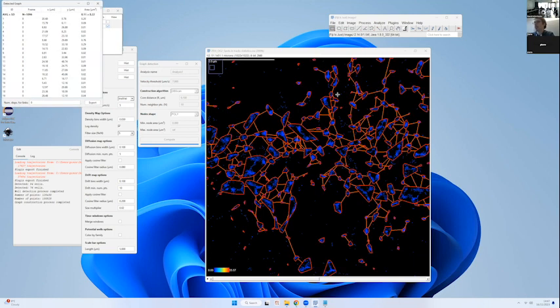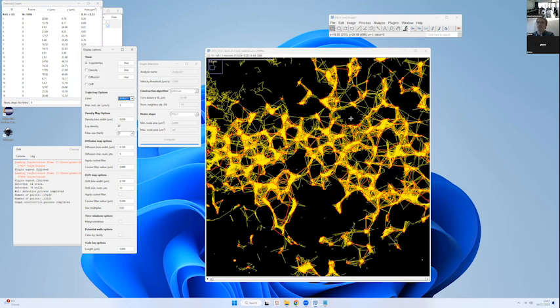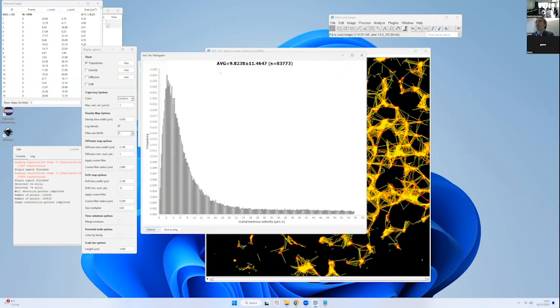I see. But suppose you start with your data, how would you define the threshold? You need to have some statistics of the delta X. Yeah, but the statistics of the displacements, you can see them in here. Okay, so this is the statistics.